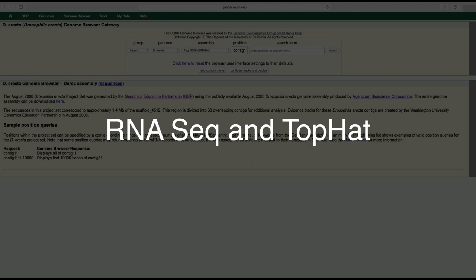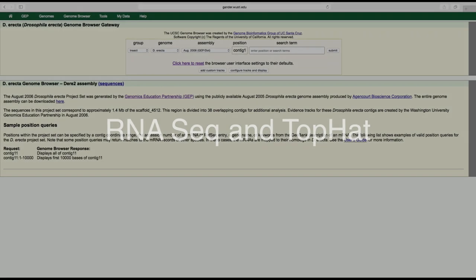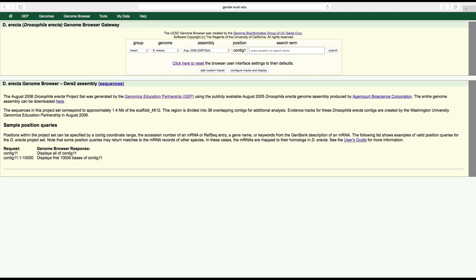The genome browser contains tracks that we can use to visualize regions of the DNA that are transcribed into RNA. This type of data can provide strong supporting evidence to the hypothesis that a certain region of a genome codes for a gene. Let's look into the RNA-Seq tracks section of the genome browser to visualize this type of data.